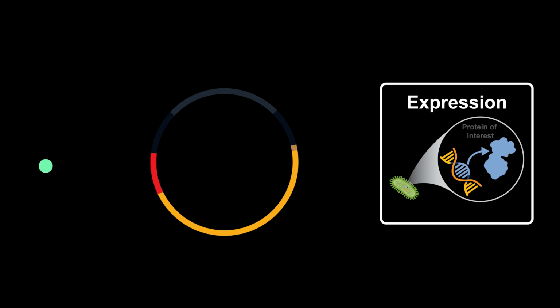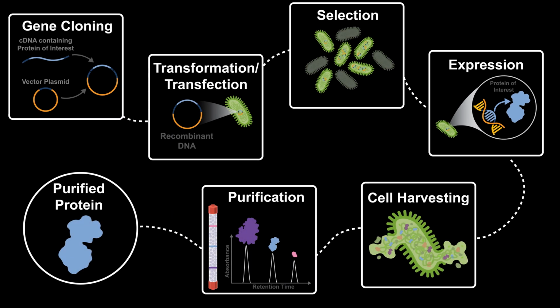As a result, only during induction, when a specific inducer molecule is added to the culture, will a bacteria start expressing the target protein. Once the bacteria has been given enough time to express our protein, the cells are pelleted and stored for later use.